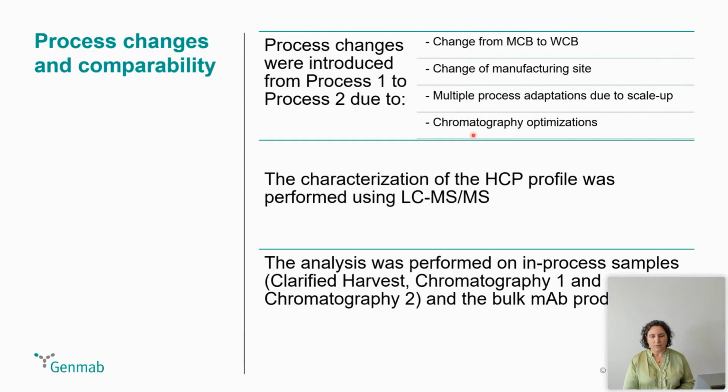Again, we analyzed different process steps with LC-MS to identify what type of HCPs were in both processes. And we analyzed, again, the clarified harvest, the chromatography 1 output, the chromatography 2 output, and the bulk drug substance. Sorry.